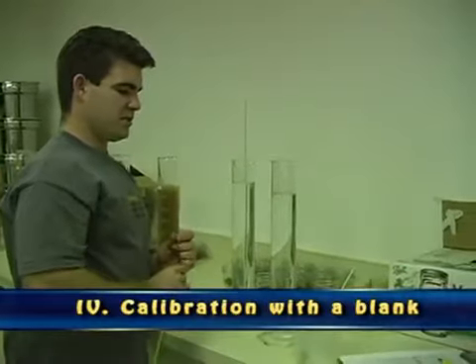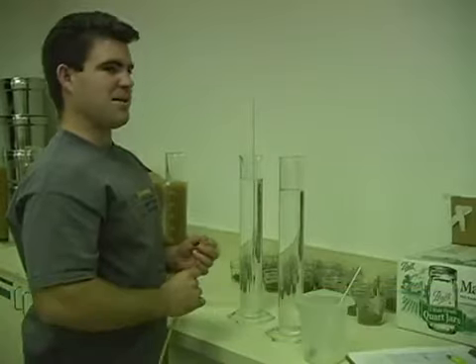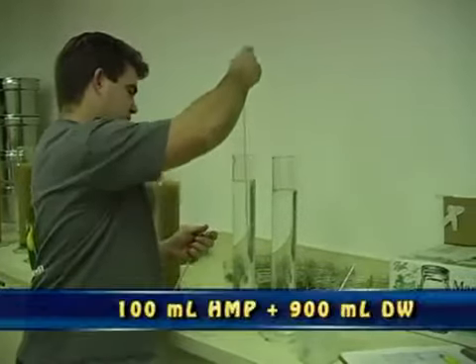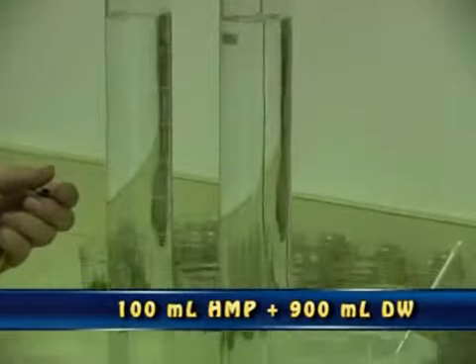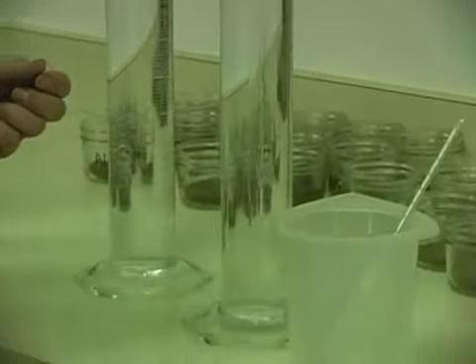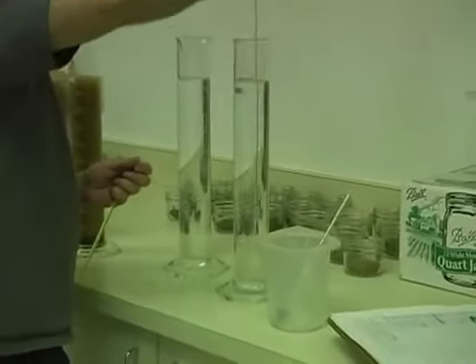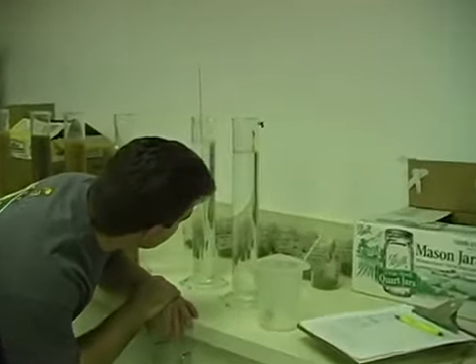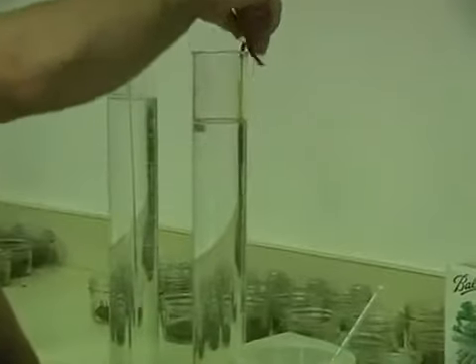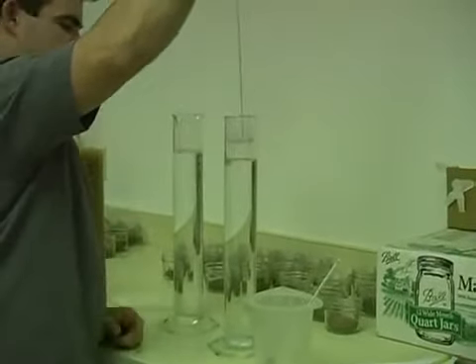DI water mixed with the sodium hexametaphosphate solution. So we're going to have to mix this up with the plunger. And first we're going to take the temperature reading. Right now it's 25 degrees Celsius. And we're going to mix it with the plunger.